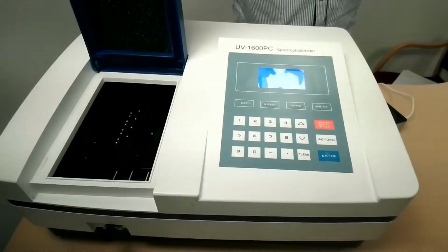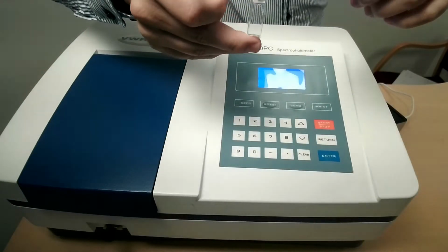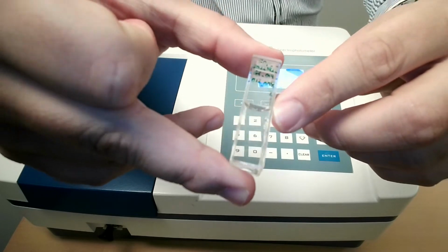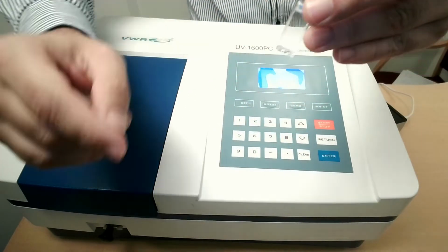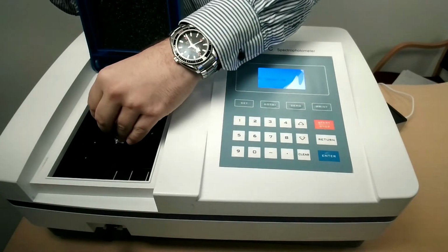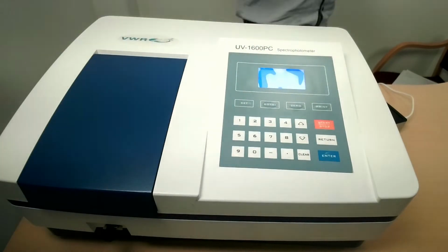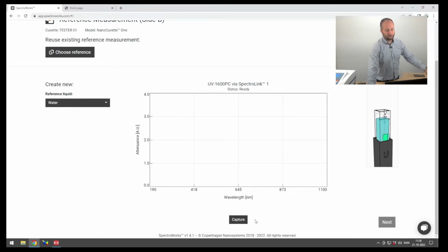Good. So I will repeat the experiment here. Maybe I'll do it in the camera here. So you see here there are some bubbles within the cuvette itself, but they are not on the filter, which means that I can still use it because it's only the bubbles near the crystal itself that are of concern. Good.